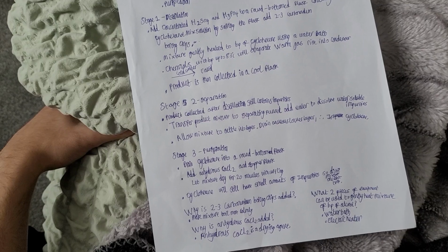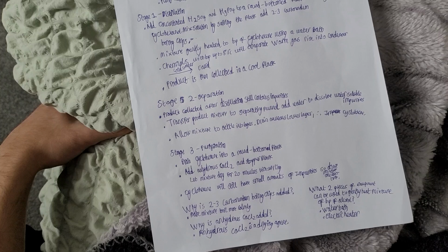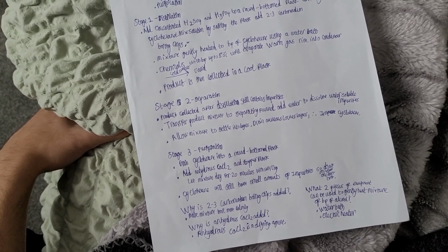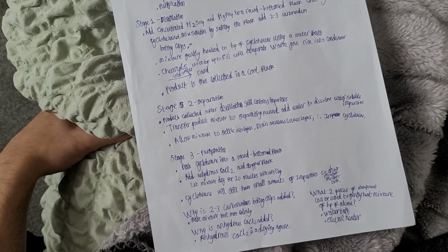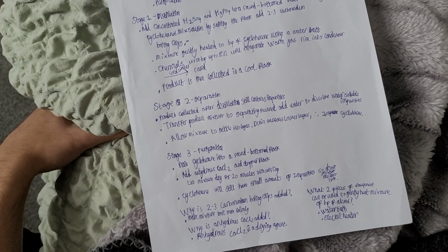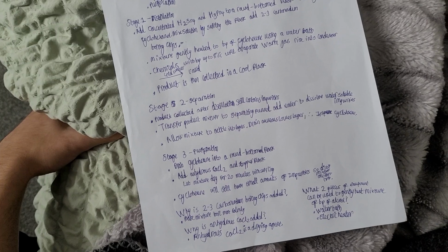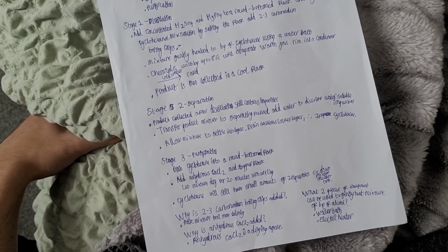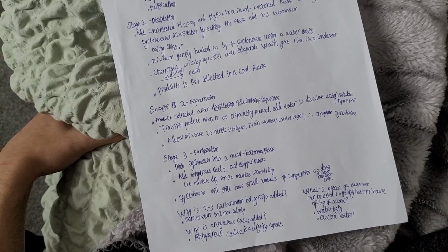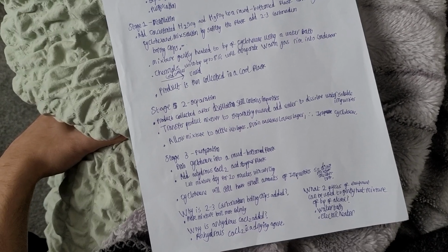Stage 1 distillation. Add concentrated H2SO4 and H3PO4 to a round bottom flask containing cyclohexanol. Mix the solution by swirling the flask and add 2 to 3 carborundum boiling chips. The mixture is gently heated to the boiling point of cyclohexene using a water bath. Then the chemicals with boiling points up to 83 degrees Celsius will evaporate, and the warm gas will rise into a condenser, and therefore we use cold water to turn it into a liquid. The product is then collected in a cooled flask.